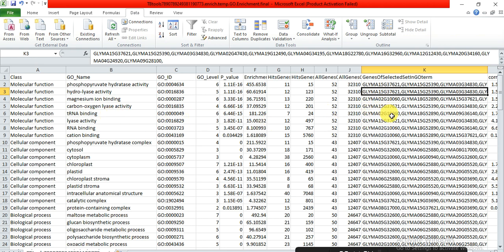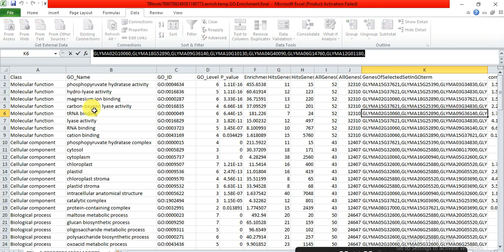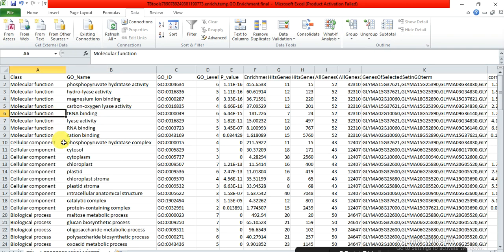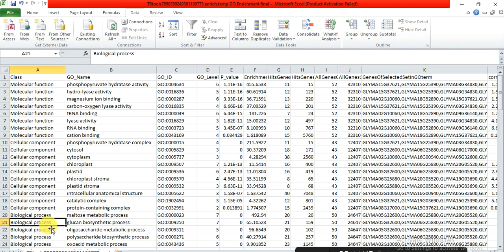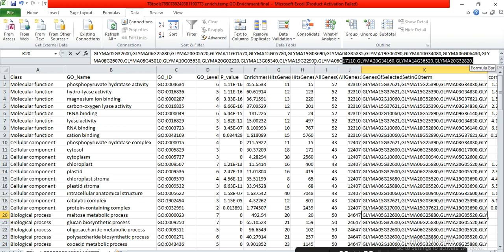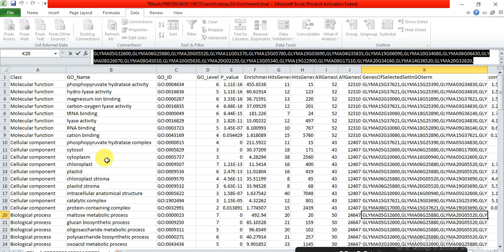Some genes are responsible for functions like tRNA binding under molecular function. Some genes are related to cellular component, such as cytosolic genes. Others are related to biological process, such as maltose metabolic process. In this way you can find which class your gene of interest belongs to — molecular function, cellular component, or biological process — and the specific characteristics within that class.